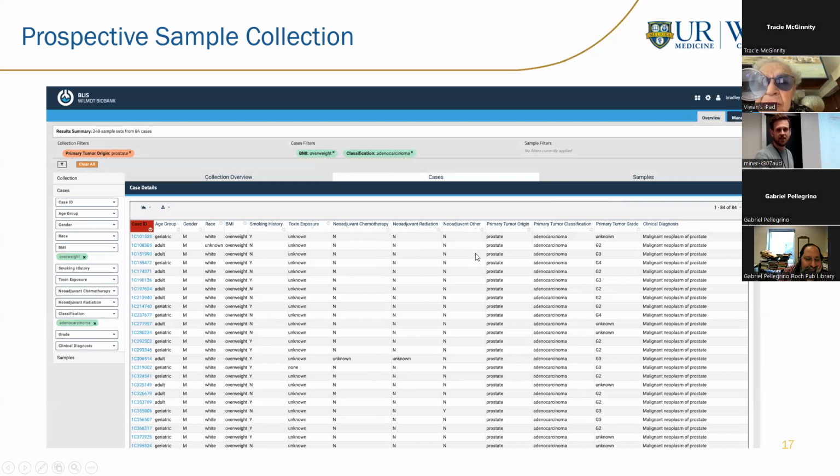Next, looking at the cases tab, right? This is information that's relevant to really all tumors, solid tumors at least, right? As I mentioned, we can do advanced data pulls and get you more disease-specific information, but this is what the NIH deems as minimum reportable information you should be looking at regardless of what type of cancer you're studying.